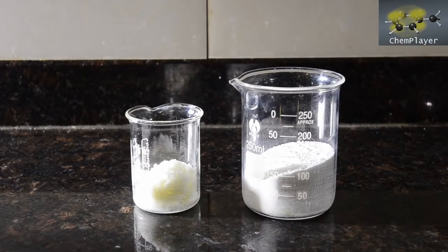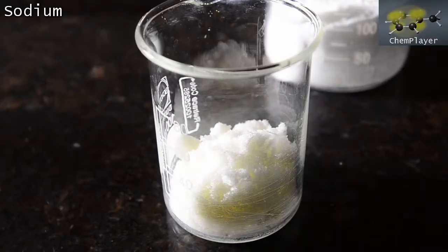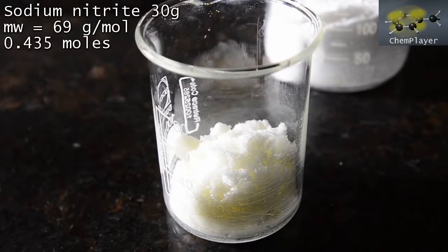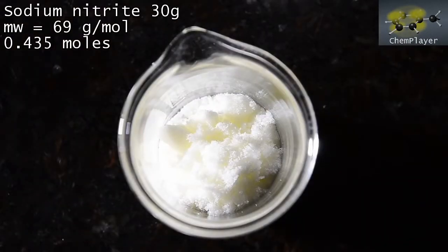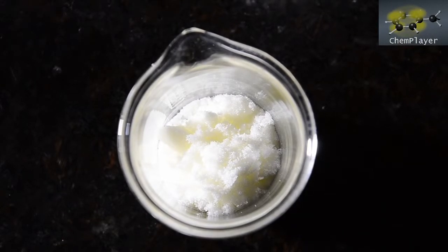Here's our 2 basic starting ingredients in the proportions for our first reaction. First of all, sodium nitrite. We're starting with 30 grams of the slightly pale yellow crystals. It's used in meat curing and as a preservative, so you can buy it from specialist suppliers online fairly easily.